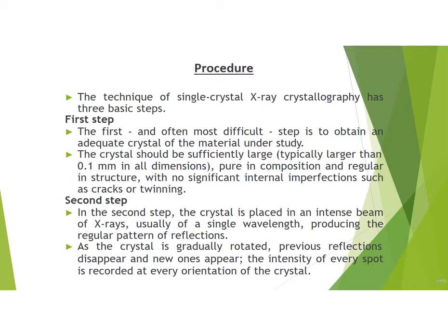It is the molecular structure itself that is derived from the single crystal X-ray analysis, and the single crystal analysis provides an unambiguous conclusion that sometimes puts an end to the argument over molecular or crystal structures. So single crystal X-ray crystallography is a very useful technique to elucidate the structure of a crystal, and it consists of 3 basic steps.